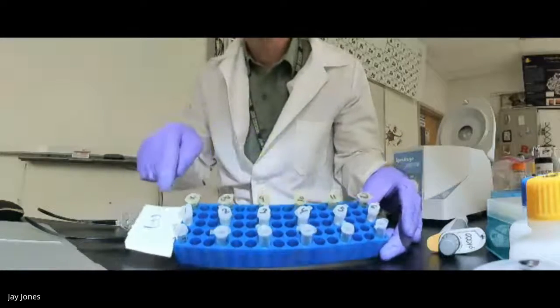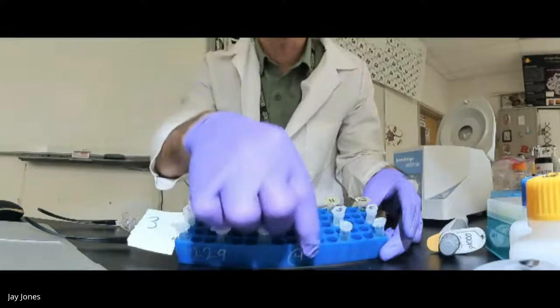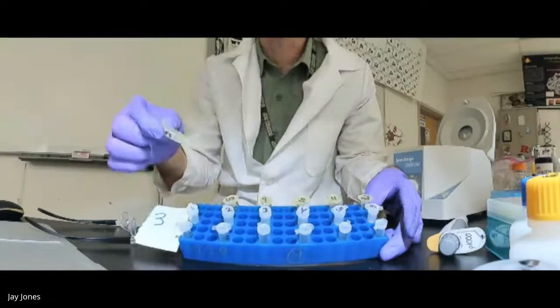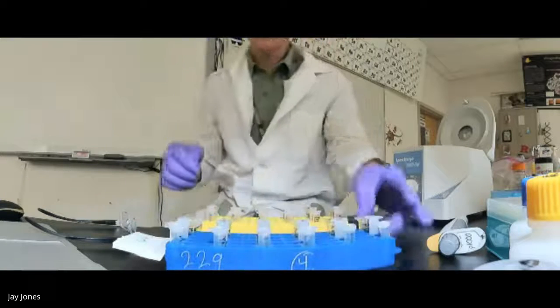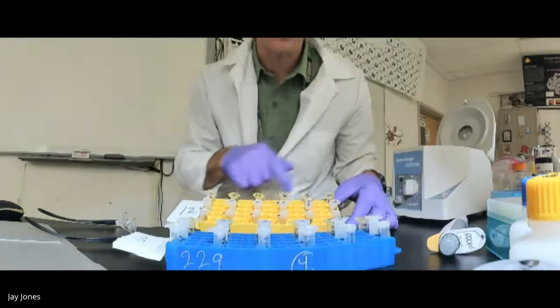Period three. We have our cells suspended in solution one, spin columns in the middle, and then final collection tubes at the end. The same thing for period 12. The difference with period 12 is I have little black dots on everything to denote it's period 12.